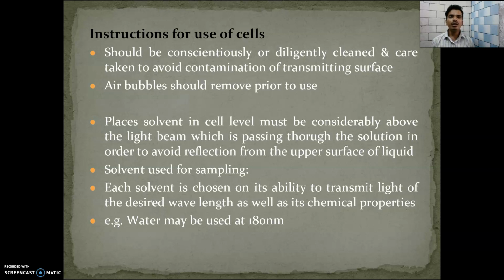The cell should be kept clean, handled delicately and carefully to avoid contamination of the transmitting surface. So cleaning is very important, and air bubbles should be removed and should not come into the sample.